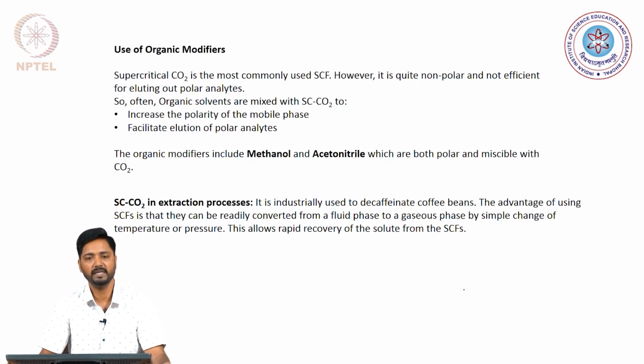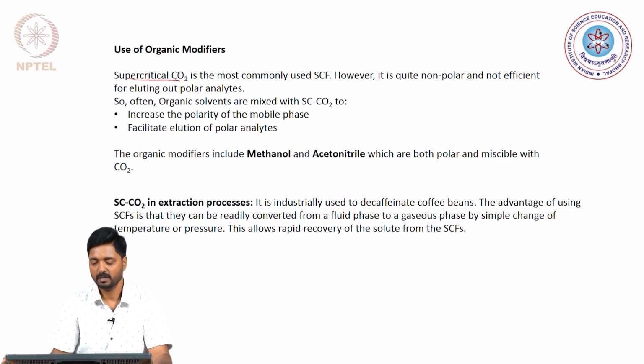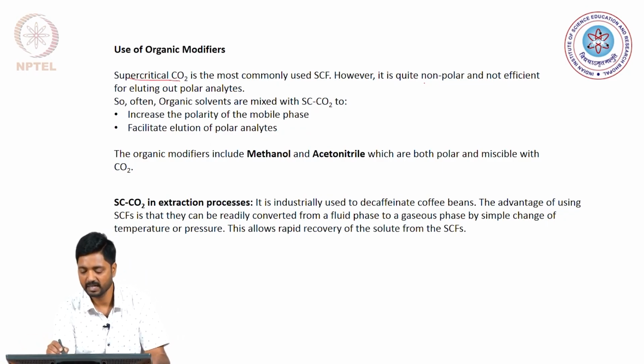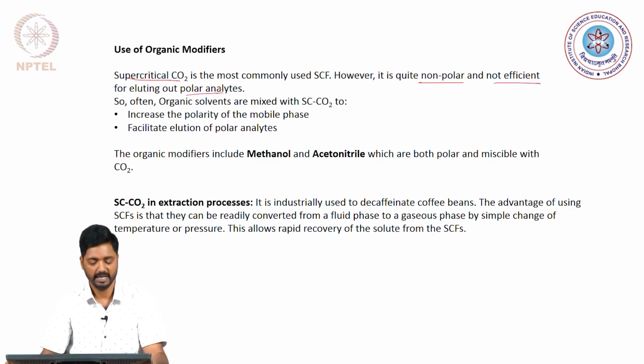So, let me delve a little bit on why organic modifiers are added to supercritical fluids. When we use supercritical carbon dioxide, it has inherently low polarity, it is almost non-polar, and hence is not efficient for eluting out polar analytes.